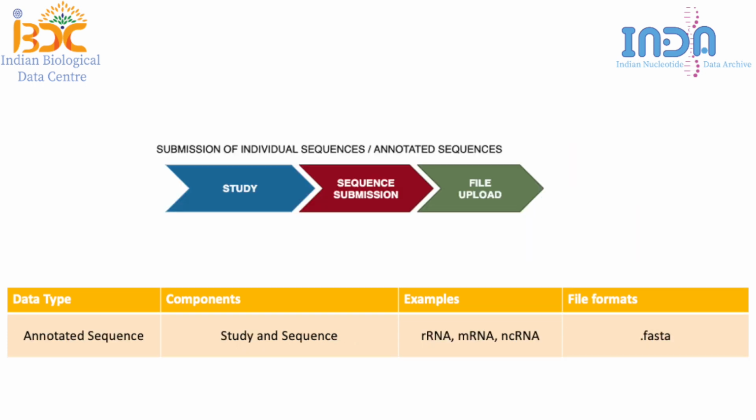A study, the DNA sequence in FASTA format, and the relevant annotations need to be submitted. For annotated DNA sequence submission like rRNAs, mRNAs, ncRNAs, and many other types of sequences.